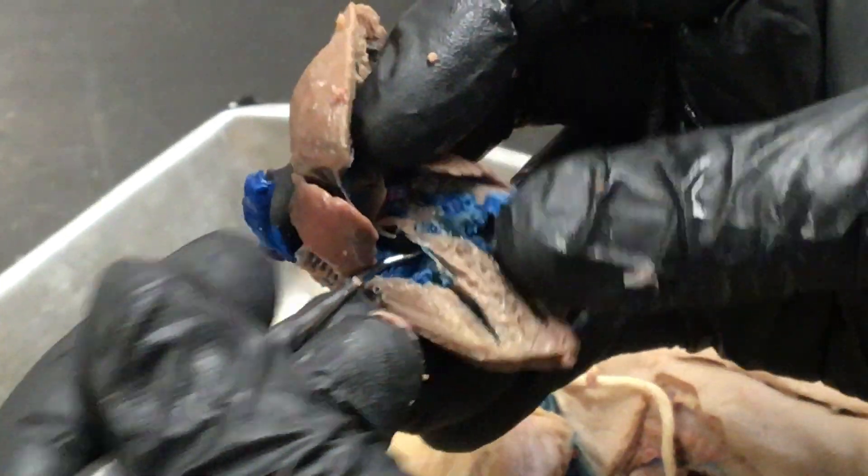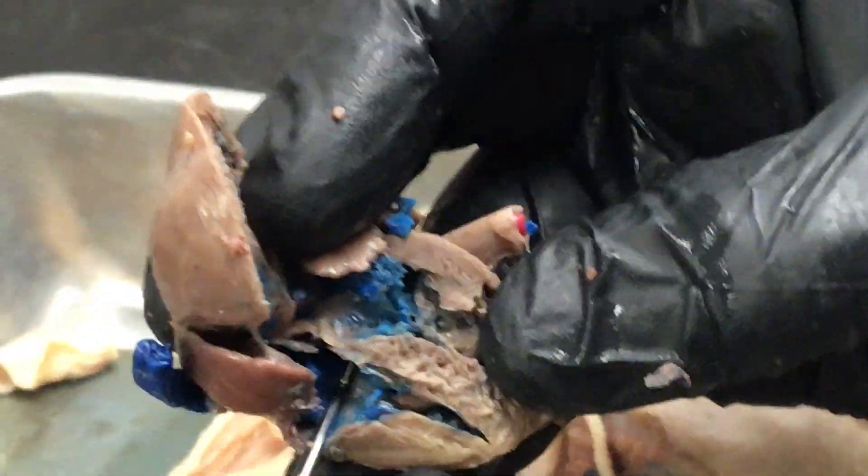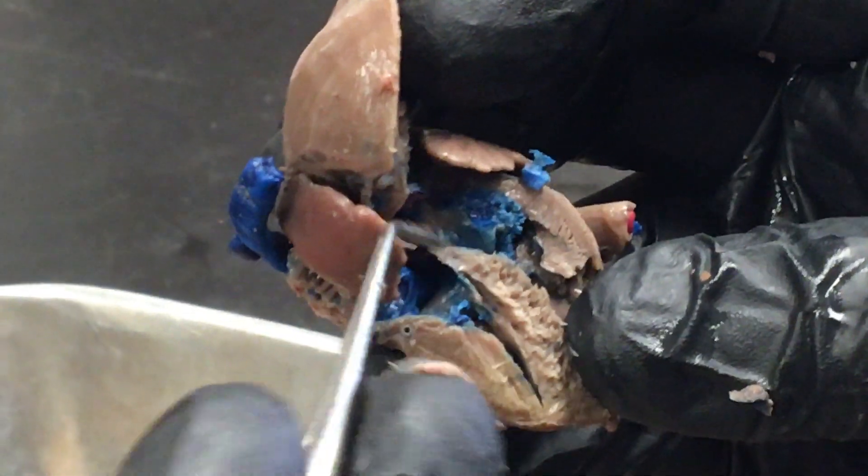This is a fetal pig so we have a connection between the two atria — the foramen ovale is supposed to allow passage of a blunt probe from the right atrium to the left atrium, and we're not finding it this moment. I don't want to destroy the heart to find this hole. The membrane on the inside of the heart shown here is the endocardium — it kind of has a shiny appearance, you can see it right there.